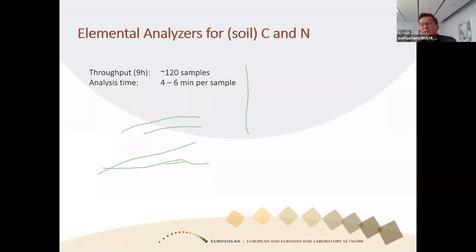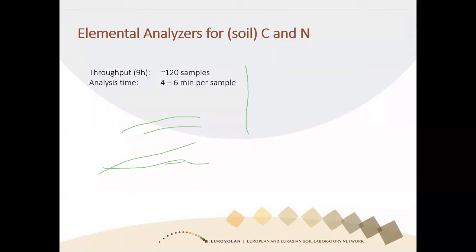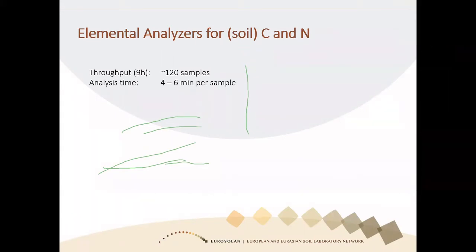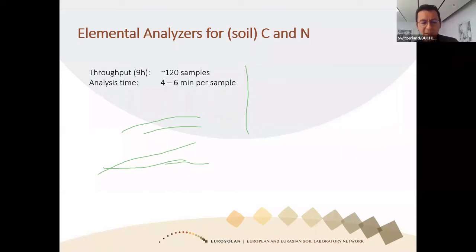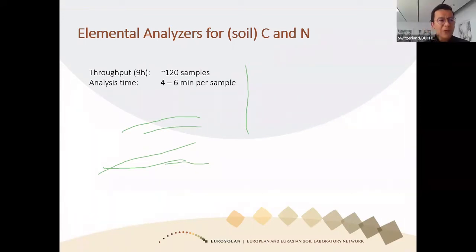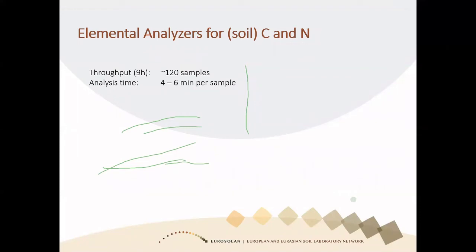As I said, the advantage of this is that it has a really high throughput. In 9 hours, you can analyze around 120 samples, because the analysis per sample takes between 4 and 6 minutes. So if you prepare all your samples and put them all in your device, you can leave them running through the night, and the next day everything is ready. But of course, we were talking about really high temperatures, around 1000 degrees Celsius. So you have to ask yourself, based on the conditions of your lab, whether it is a good idea to leave this instrument running through the night.